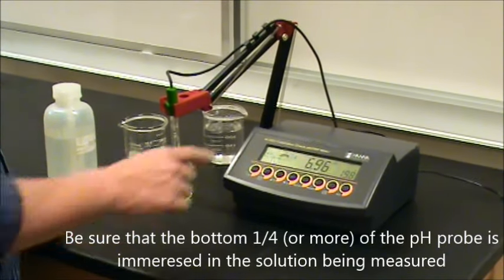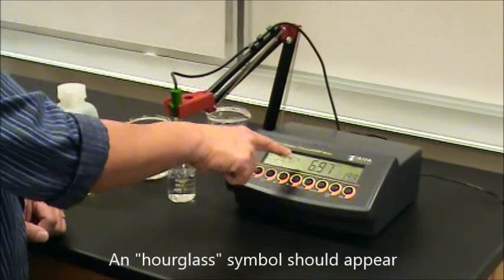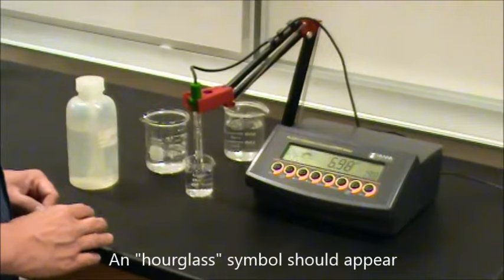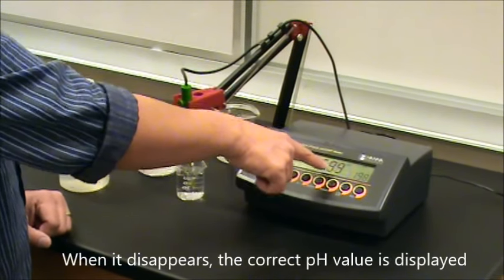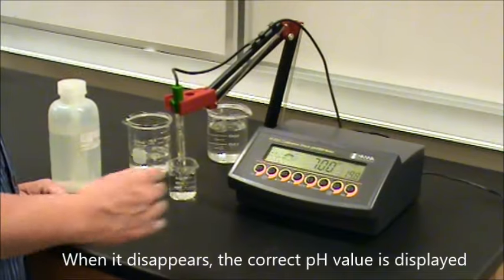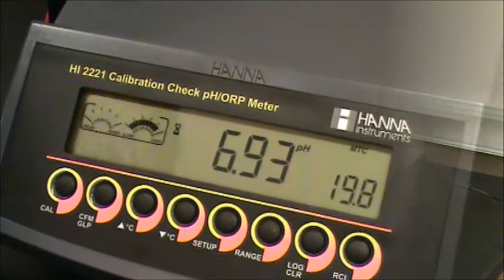There will be a little hourglass which will show that it's trying to stabilize. Once the hourglass disappears, these numbers will not fluctuate much more and you can go ahead and read that as your pH.